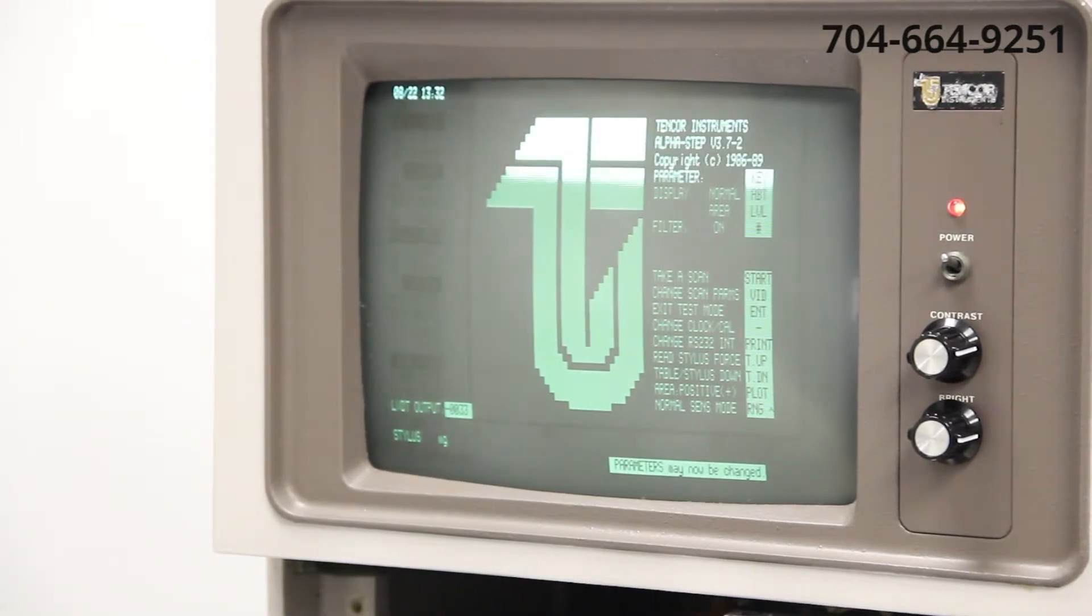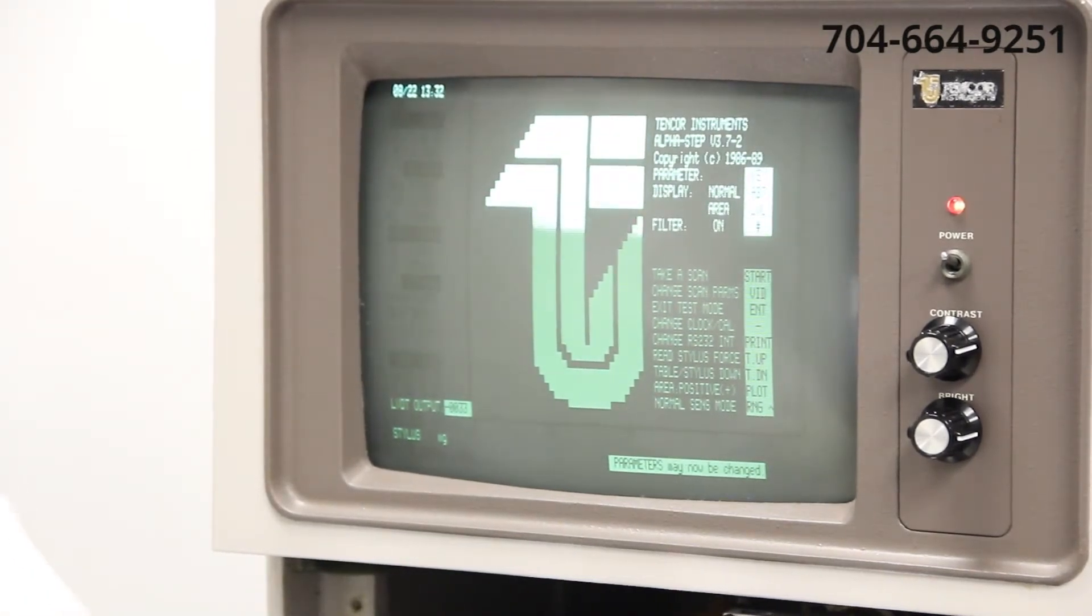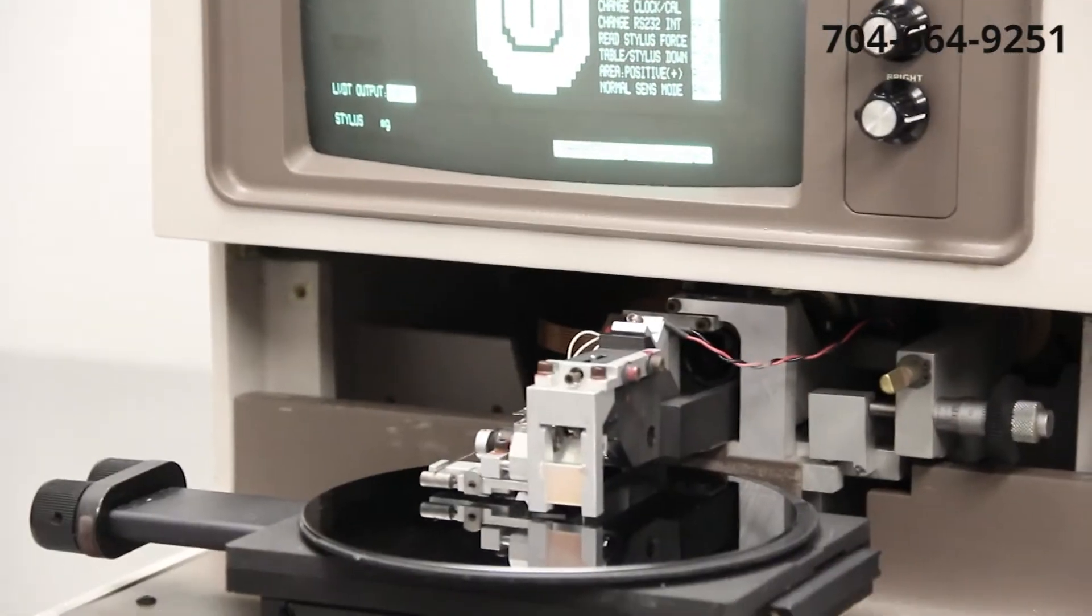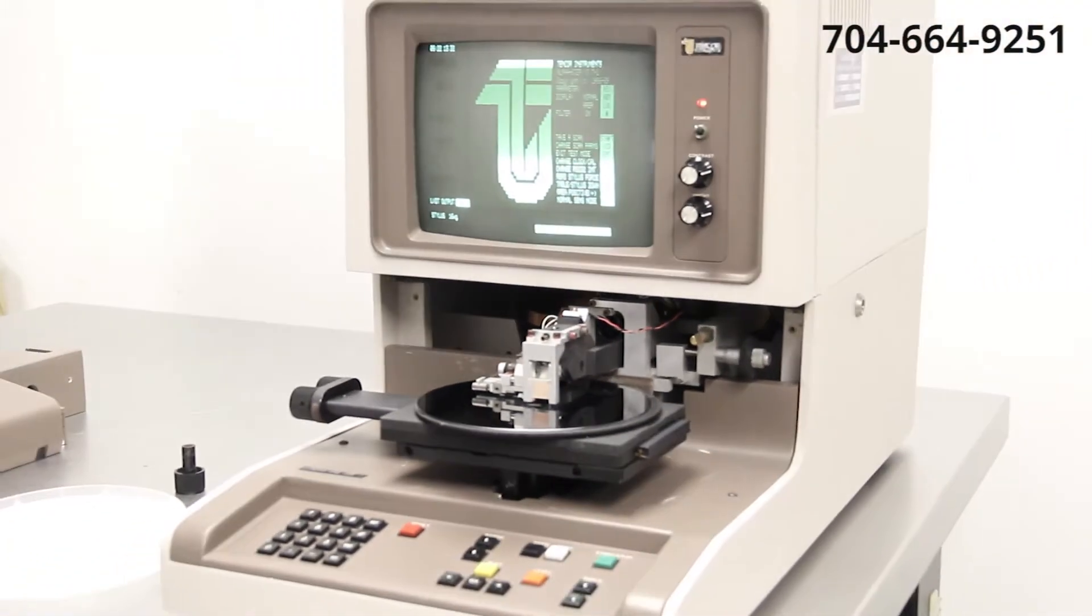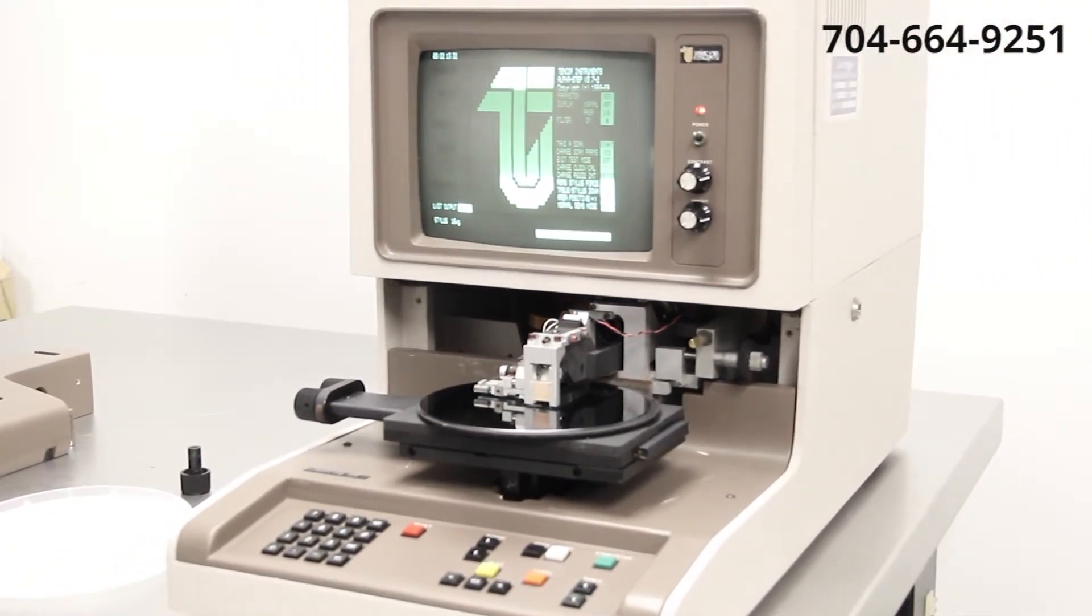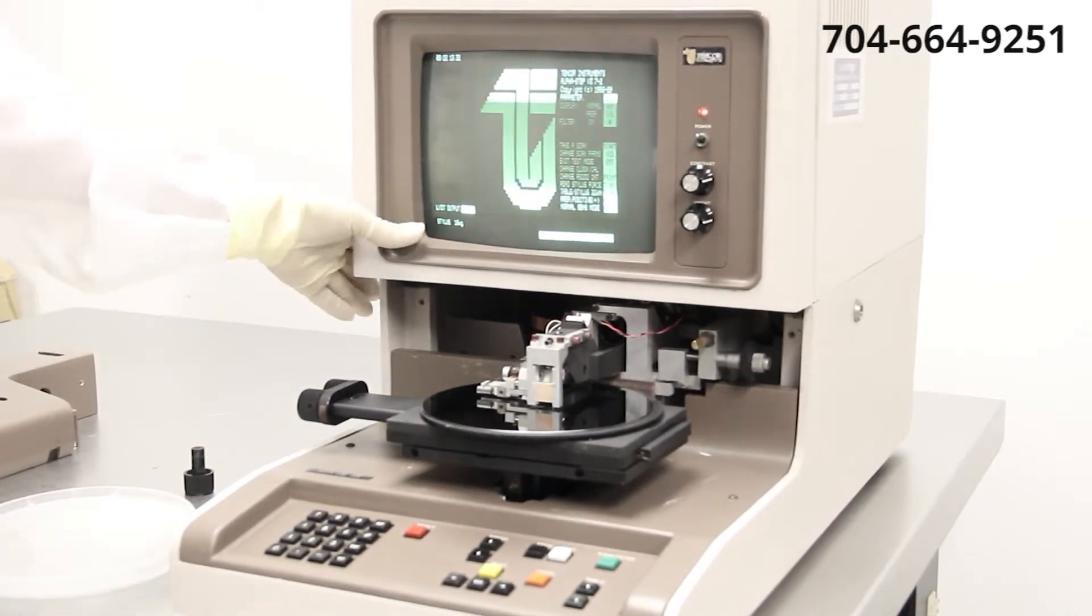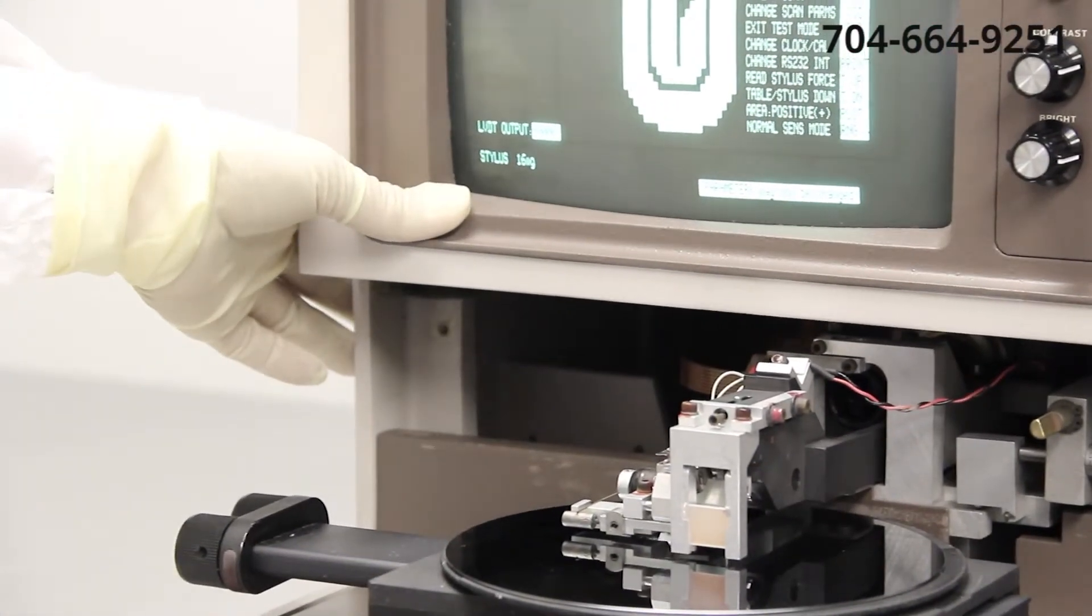To initialize the stylus force calibration, we're going to press the table up button one time. The tip will come into contact with the substrate and then retract. As you can see here, the stylus force is really at 16 milligrams.